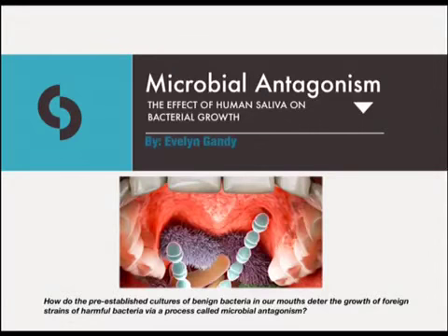Hi, I'm Evelyn, and I did my project on the topic of microbial antagonism and the effect of human saliva on bacterial growth. This experiment will aim to answer the following question. How do the pre-established cultures of benign bacteria in our mouths deter the growth of foreign strains of harmful bacteria via a process called microbial antagonism?